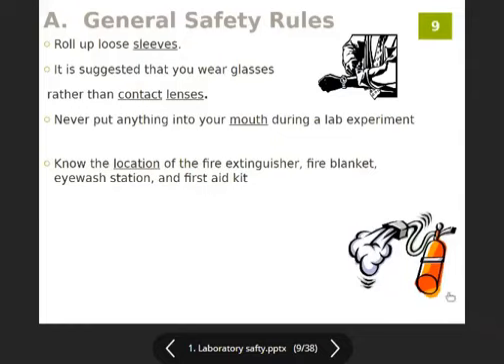So if there is a fire in the lab, we have a fire extinguisher to use. Also, we have fire blankets. We have a sand basket. So we have lots of things to fight with the fire. But inshallah ta'ala, it won't happen. But we have covered everything.